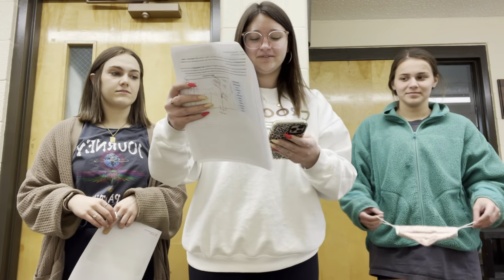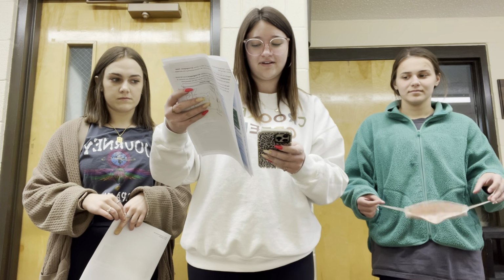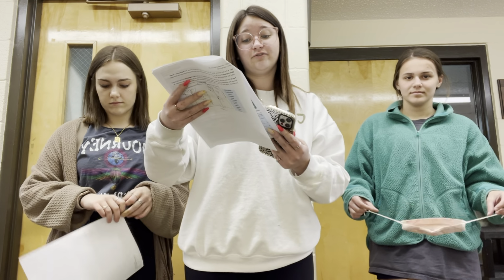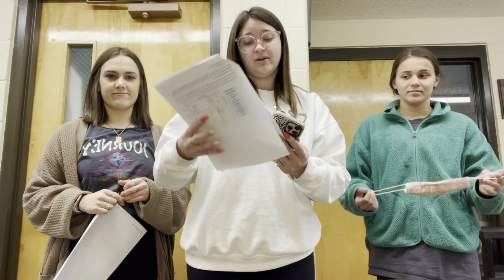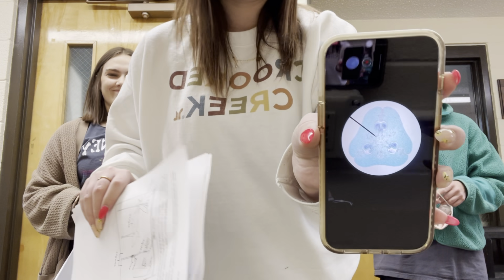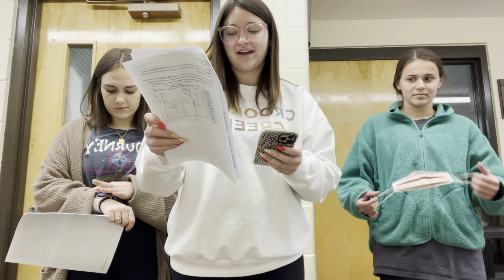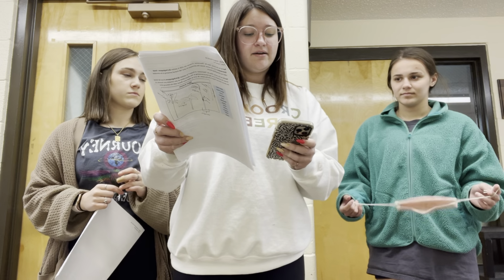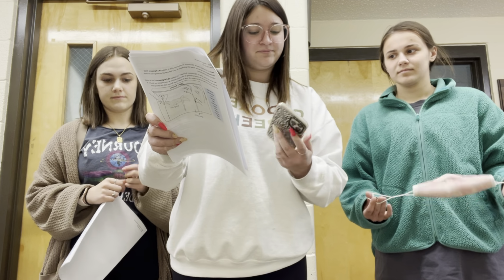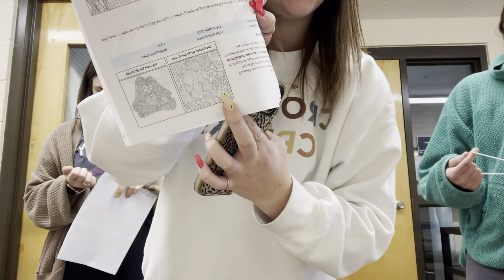And then the other two we looked at, we have the lily fruit sac embryo, which is also the female lily. Looks just like this, nice little blue, and then we drew it right there. And then the last one we looked at was the lily anther with pollen grain, which is the male lily. Looks just like this, some lovely green, and then we drew it right there, like that.